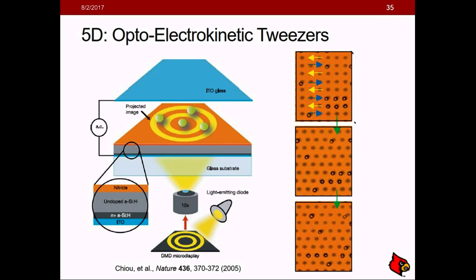And from that, you can go to the journal article. It has some interesting videos showing this, and others have replicated this as well, is that the video shows like a conveyor belt of these dots, and you can move these particles left to right and in different directions. So you have these dynamic virtual electrodes that can be dynamically reconfigured within your system.